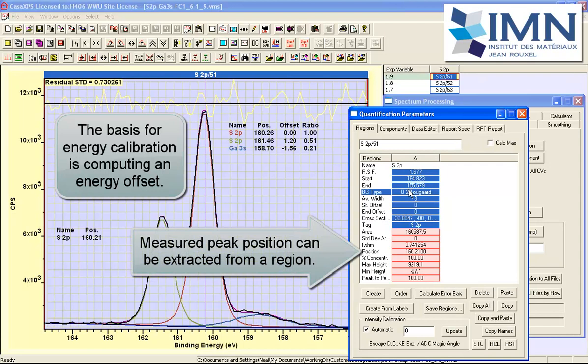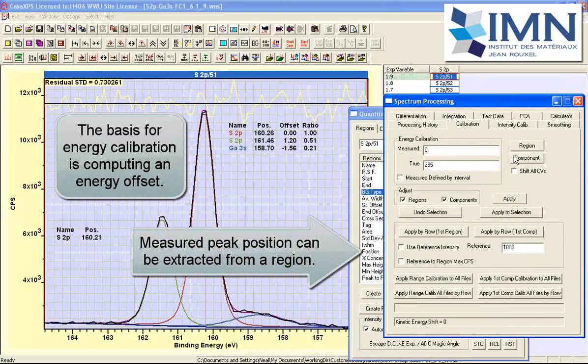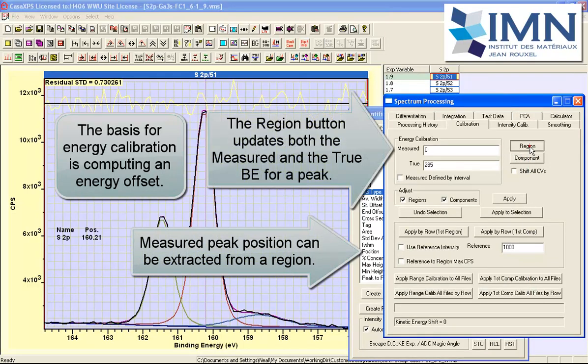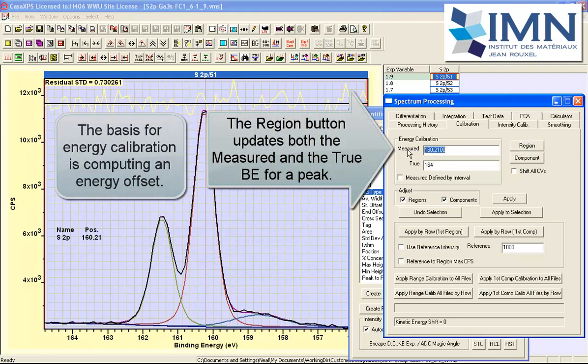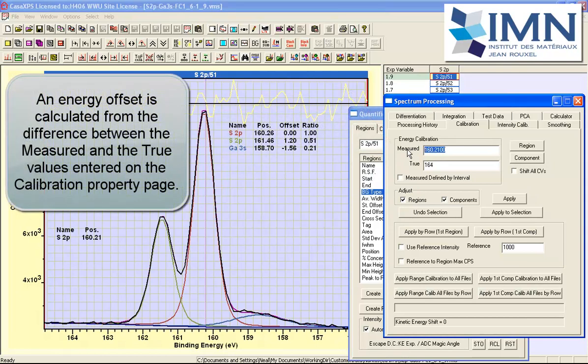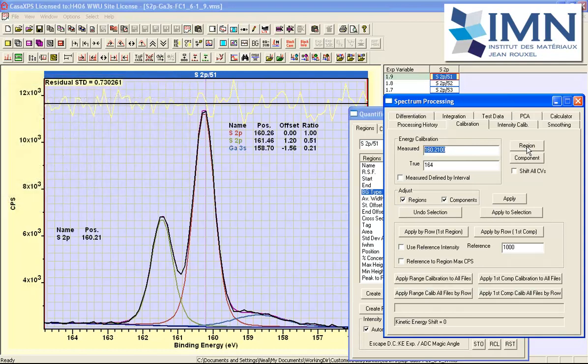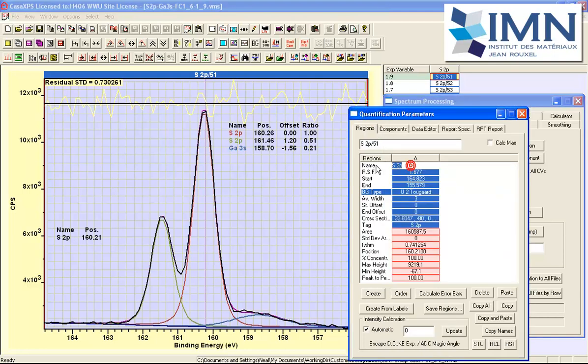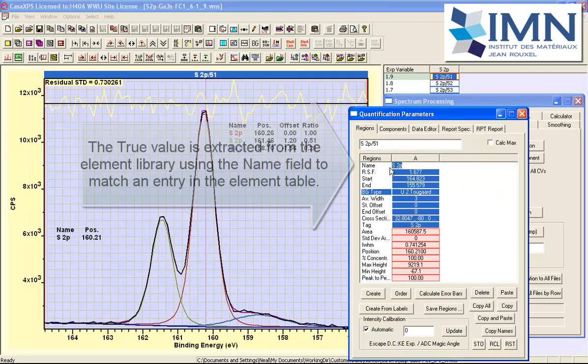Once this region is selected then there is a button here that will allow us to pull in information from that region. That is to say the selected region. If there were more than one region on these data then the selected one would be the one that is acted on by this regions button. And the value has come in from the region. The true value has come in from the information gathered from the element library based on the name field in this region that was selected.